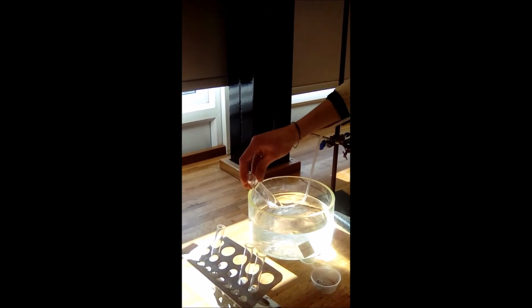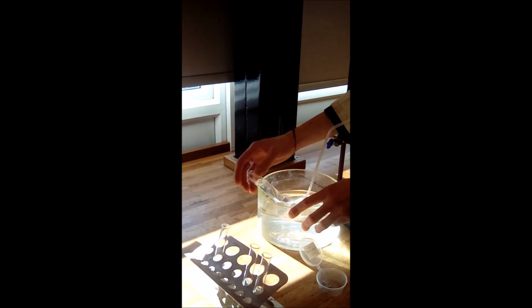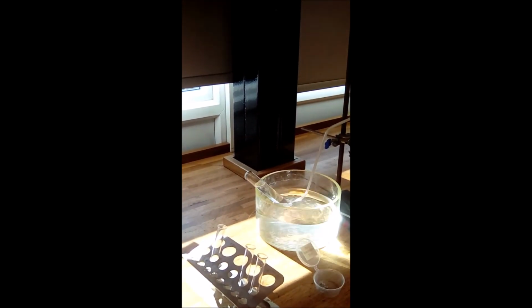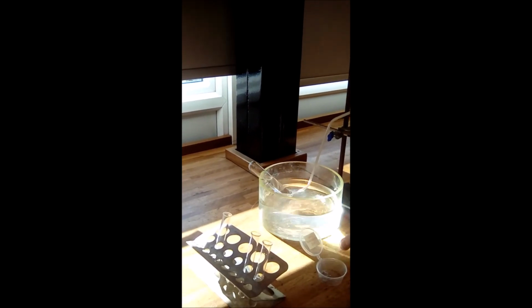So then we put the bung on, and what we do is we collect the hydrogen in this test tube here. But the experiment does take quite a long time because there's quite a lot of air in this whole experiment. So what I'm going to do is cheat and do a shorter experiment.